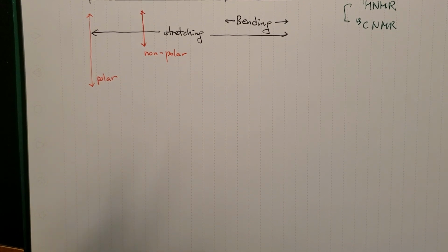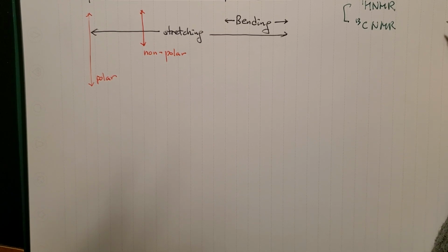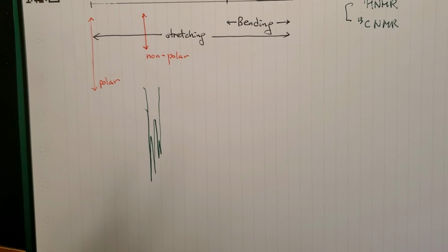Nevertheless, it's good to know about some more details of those carbon hydrogen related peaks on the IR. So let's talk about that a little bit.